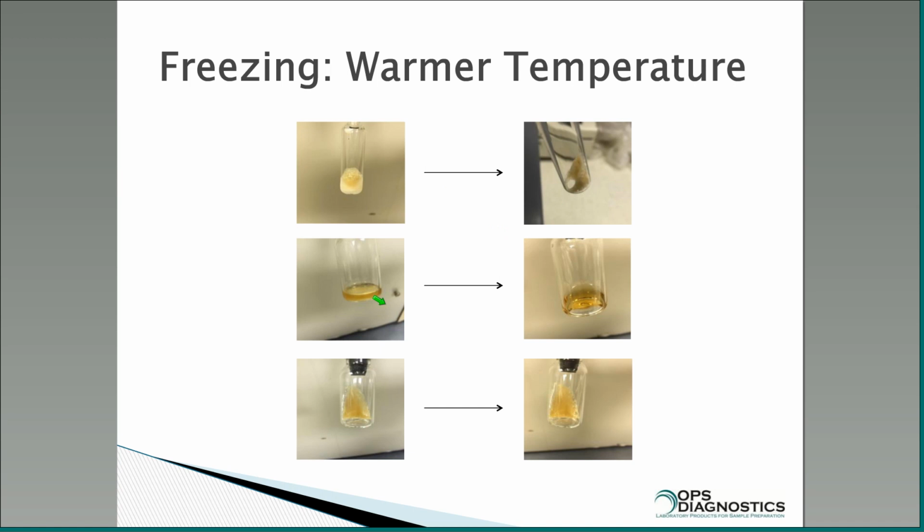Over here, just like I did with the liquid nitrogen, I had a sample where I froze flat in a vial, put it on the freeze dryer, and by the time it was done, it was liquid. So that melted back. Here's the same sample, same volume anyway, which I put on an angle, and I let that go, and then it ended up drying.